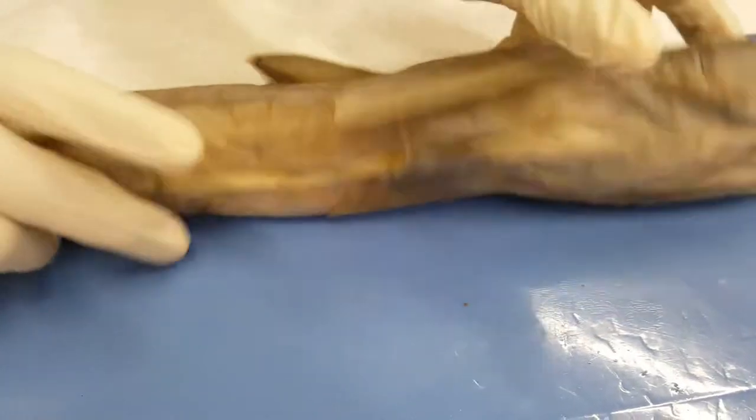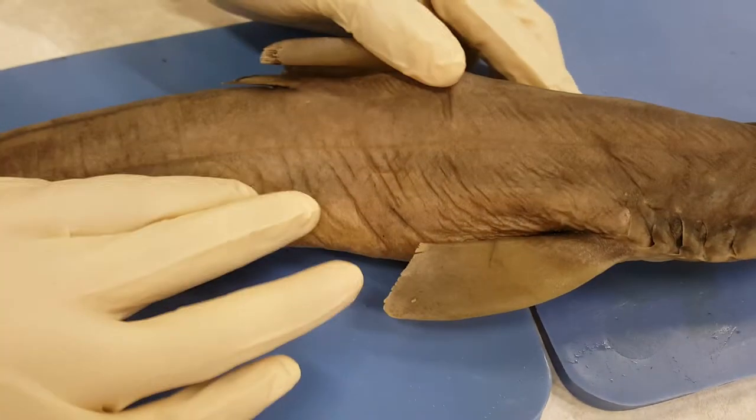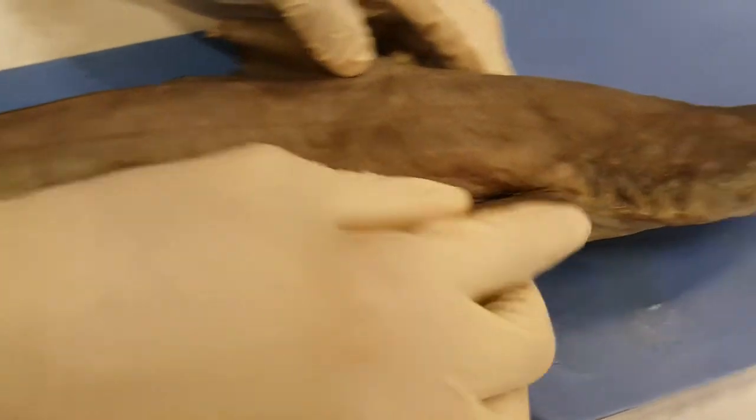Then we have the lateral line, which is basically the line that goes along here. It just extends to the pelvic fin, which is the lower one right here.